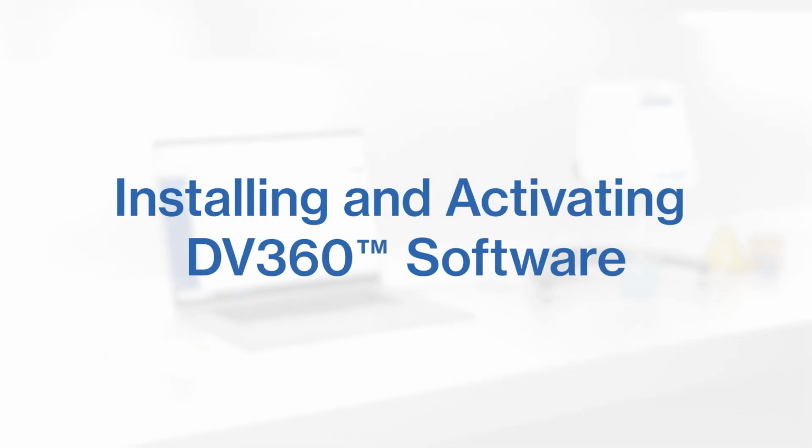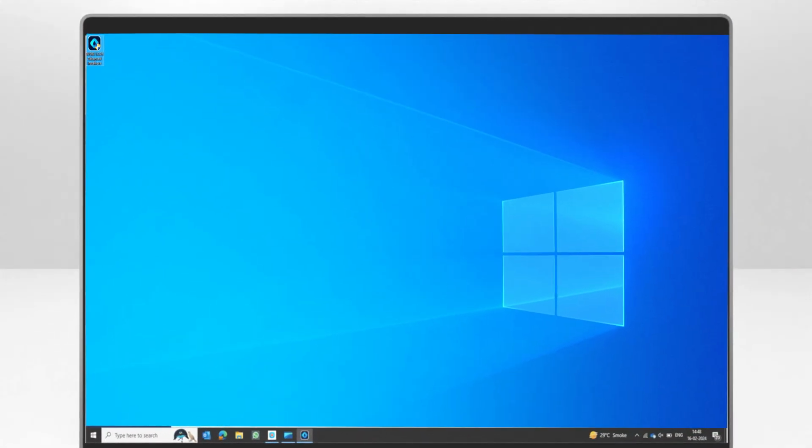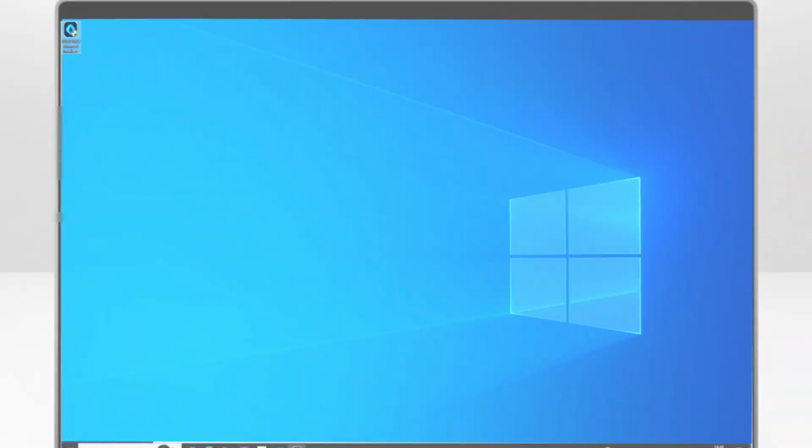In this video, I'll guide you through installing and activating AMETEK Brookfield's DV360, the software that makes viscosity measurement easy. Let's get started. You'll receive an email from AMETEK Brookfield with a download link and an activation ID for the software.